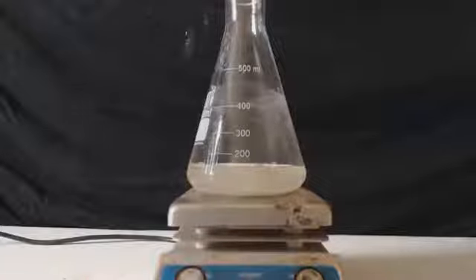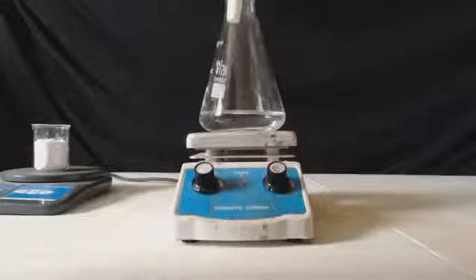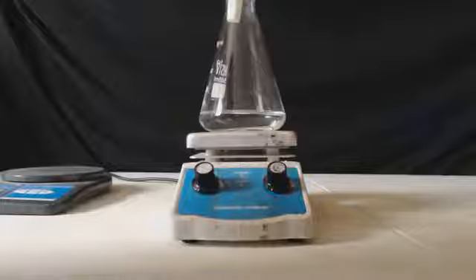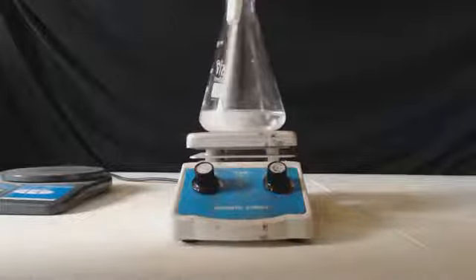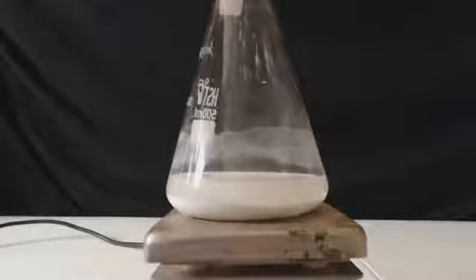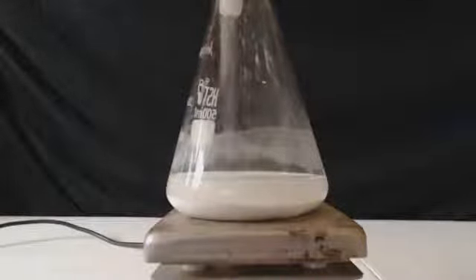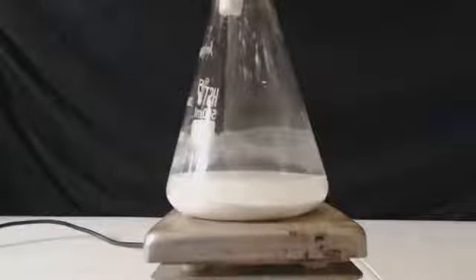Alright, I'm going to do this experiment a second time, this time with no heat. I got 100 milliliters of just regular water, room temperature. I'll have 47 grams of the cream of tartar. When I add the sodium carbonate when it's cold, it doesn't fizz really. I mean, it does a little bit, but not like it did when it was hot, that's for sure.